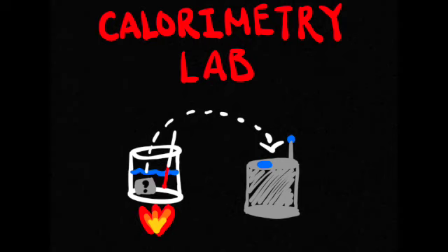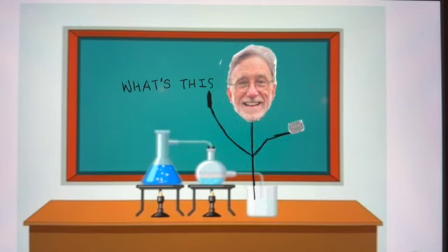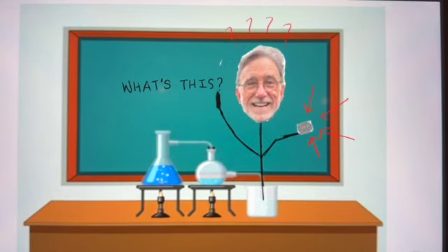Calorimetry lab. The purpose of this lab was to use calorimetry to determine the specific heat capacity of an unknown metal in order to identify the metal. In other words, we were asked, what's this? Let's find out.